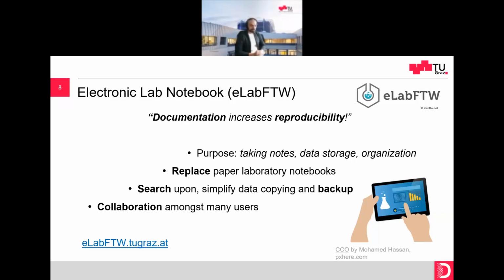You could use it just for your own purposes, and you don't have to deal with anyone, but the idea behind it is to have a good collaboration platform. It's good not to think of things like Google Docs or Excel. It has another form of collaboration, but it fosters collaboration and makes it easy to share information with your colleagues and your peers.